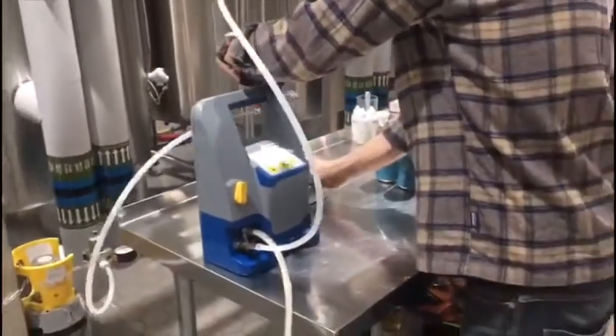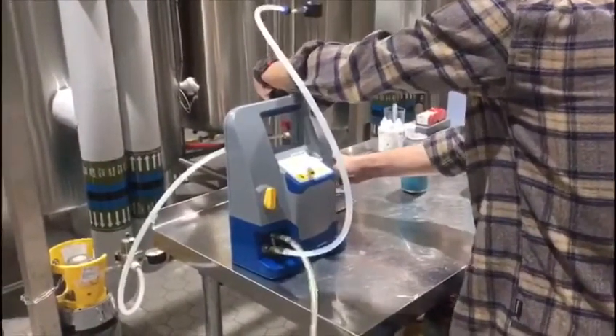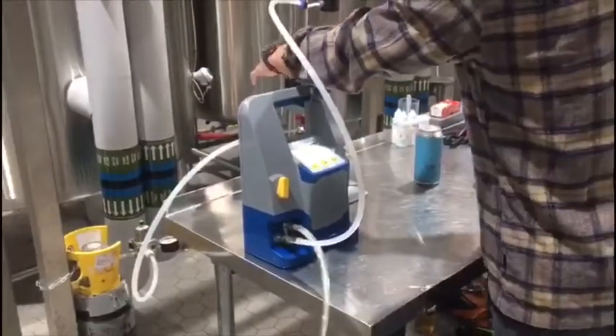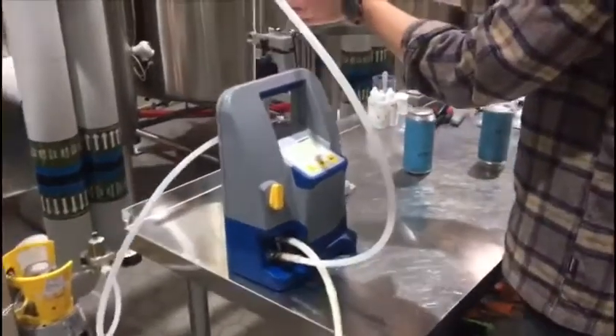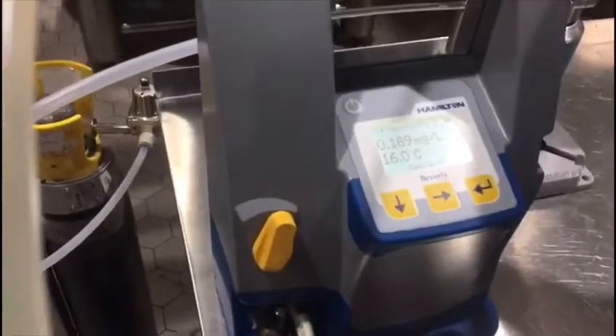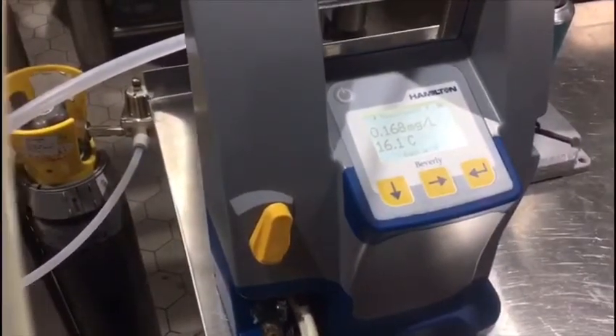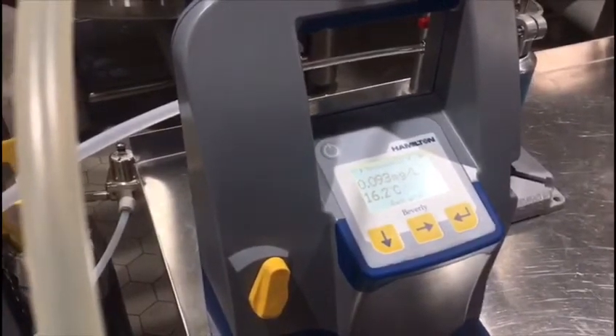On this next can, even though it's warm beer, we should get a more accurate and stable reading now that the machine has purged oxygen. It's quick and easy to use, pretty robust. We've been using it for canning for the last nine months and it's doing a good job for us.